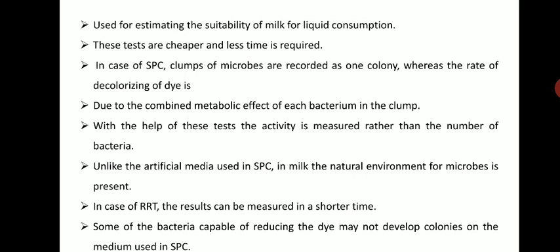In case of SPC, clumps of microbes are recorded as one colony, whereas the rate of decolorizing of the dye is due to the combined metabolic effect of each bacterium in the clump. So with the help of this test, the activity is measured rather than the number of bacteria. Basically, in this test we can only assess the quality of milk.